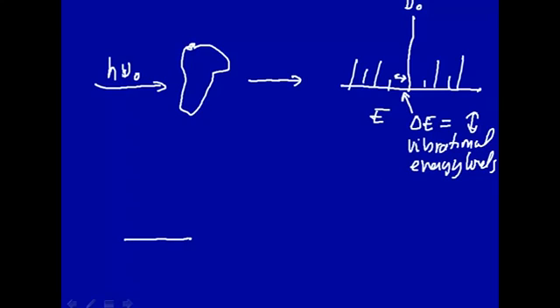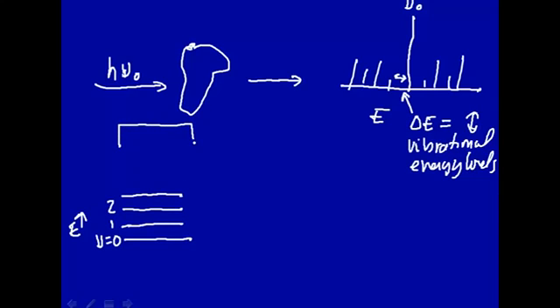Now, one way one explains that is that here you have a system. These are vibrational energy levels. This is energy going up this way. This would be the vibrational energy corresponding to quantum number 0, 1, 2, and so on. One postulates a virtual state, these chemists. So the electric field of the light, remember light has a transverse electric field which oscillates this way, will oscillate the electrons in this molecule.